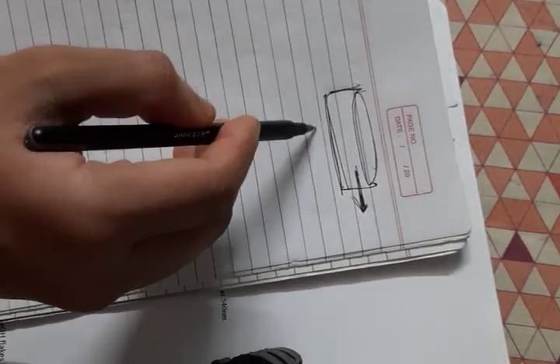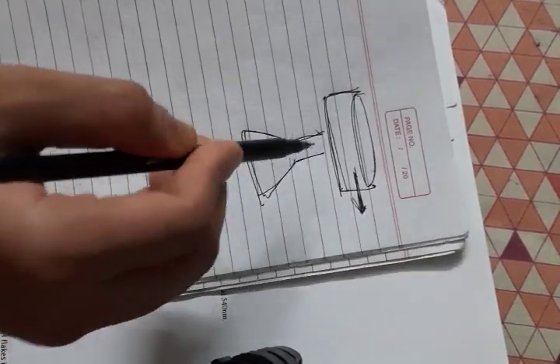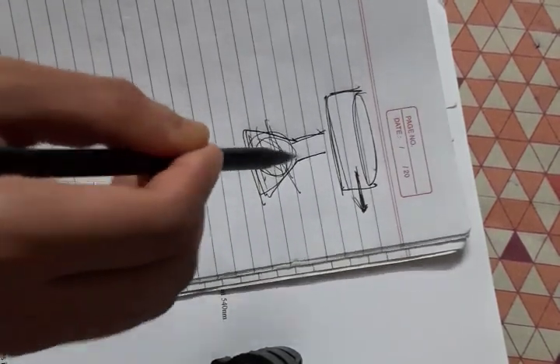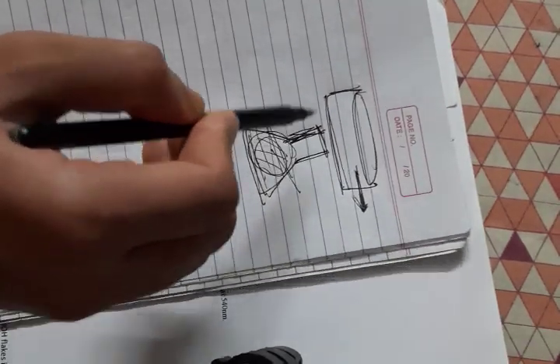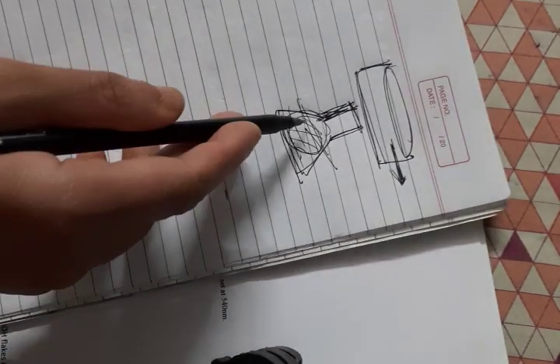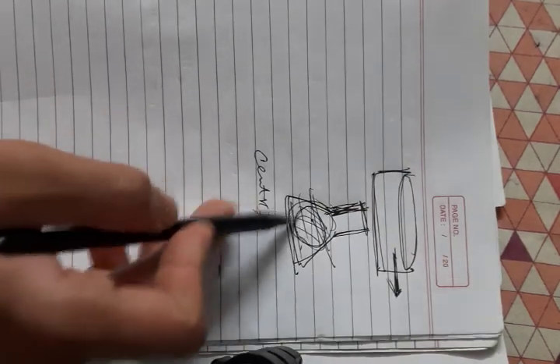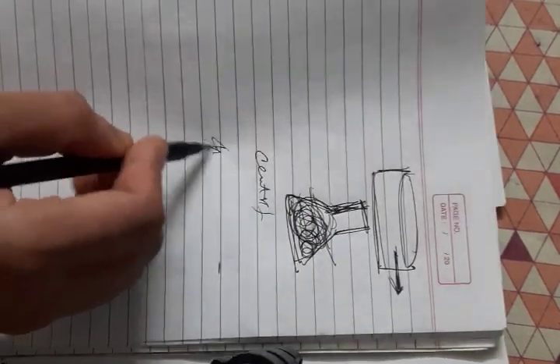So after that, what would we be doing? We would be culturing that bacteria, or allowing it to ferment in a fermentation media. So we need a fermentation media, right? For that, we need to prepare it. We can consider it later in the procedure section. But here, what we need to consider is the requirements. After that, we need a centrifuge, although it's not written here, to get the supernatant, which contains the maltose, sorry, the amylase.